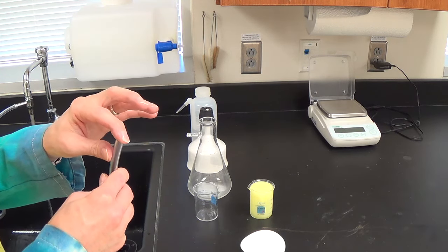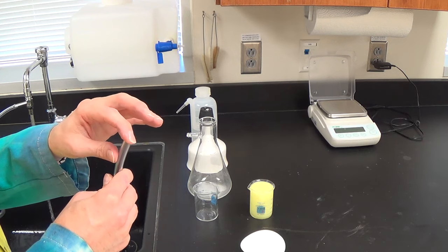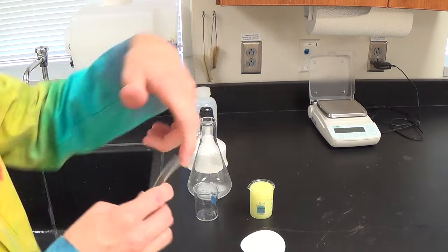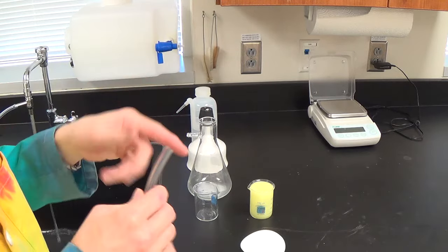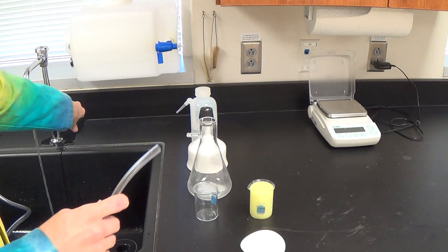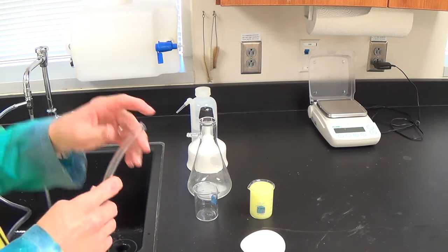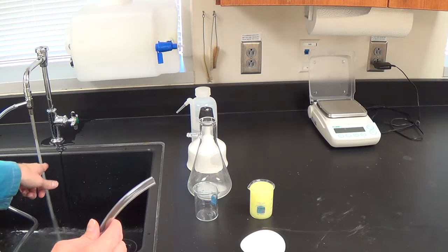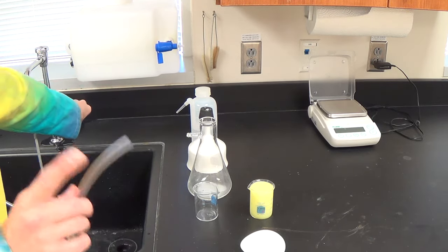And if you were to put your finger on it, you could actually feel that there's some pulling of the air through there. It's going to pull on your finger a little. It's not like my finger's going to get sucked inside the tube or anything. It's not pulling that hard. Truly, though, the faster you turn this on, the more it's going to pull the air through. So you do want pretty good volume of water coming through when you're ready.